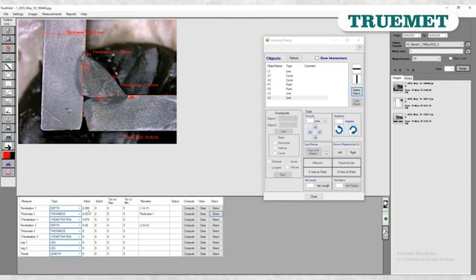When I measure the penetration 1 and thickness 1, percentage penetration is automatically calculated. Doing the same thing with thickness 2 using the direct tool. This is my thickness 2 and accordingly penetration 2.